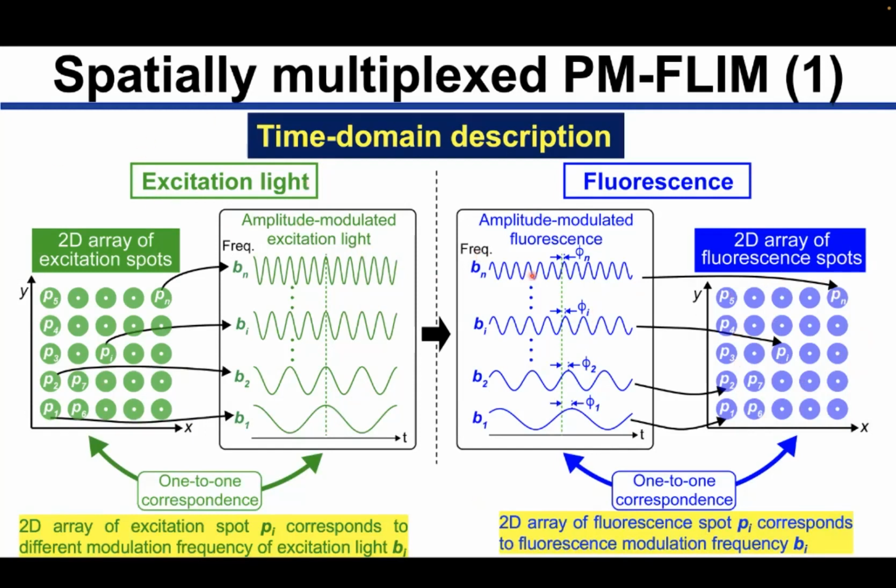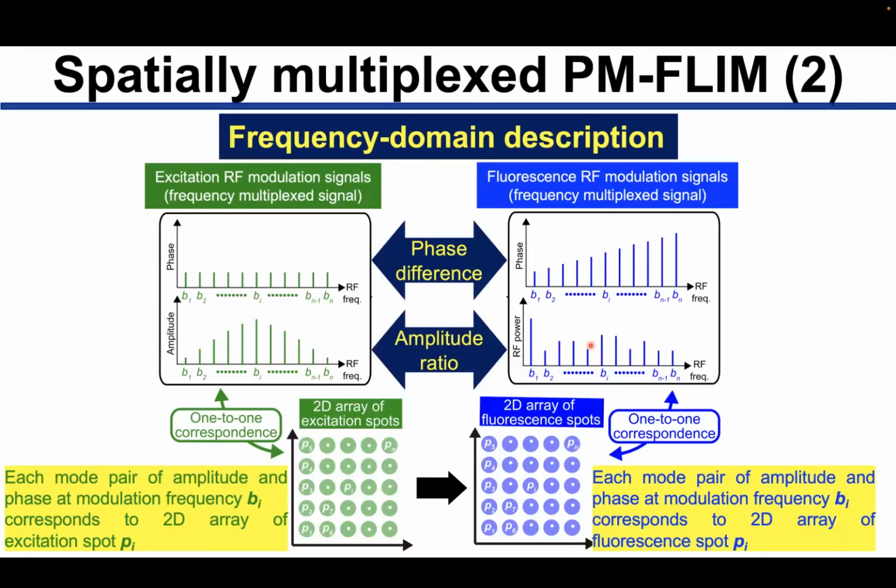However, there are some differences of amplitude and phase between fluorescence and excitation, depending on the fluorescence intensity and fluorescence lifetime.